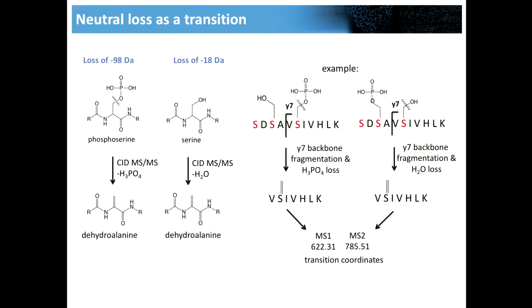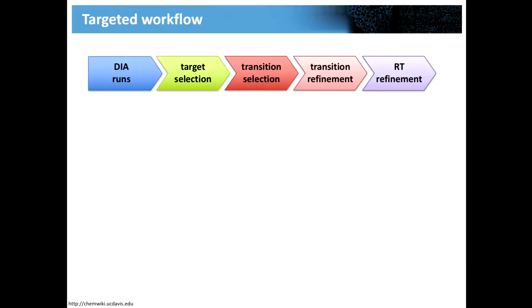So of course, all of these parameters can be defined either in Skyline or whatever tool you're using, and of course, in the parameters of the search. You just need to be aware of them when you're selecting the transitions.